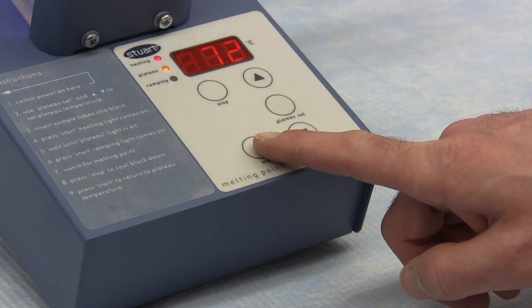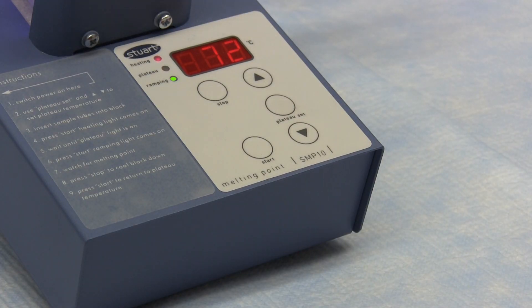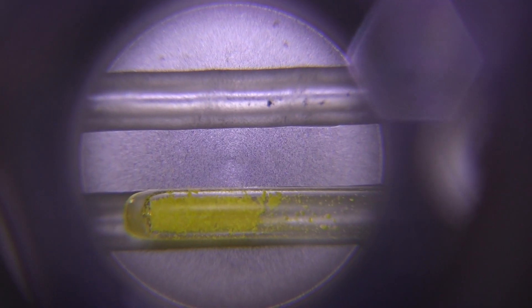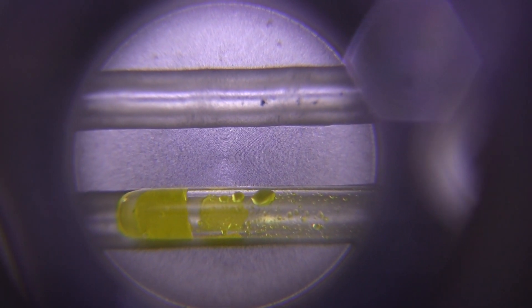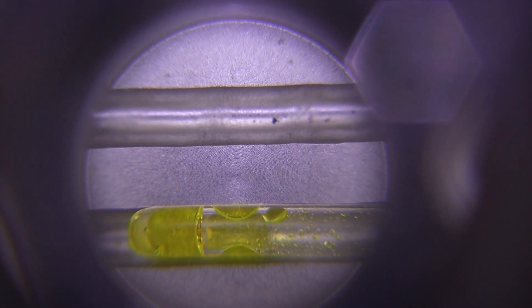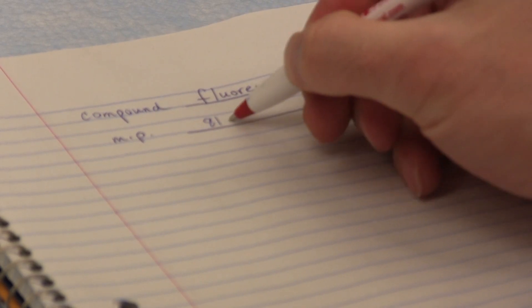Press the start button again and the block will begin to heat at the ramp rate of 2 degrees per minute. At this stage, notice that the plateau light will go out and the ramping and heating lights will both be illuminated. Continue to check on the sample through the magnifier until the solid begins to melt, then note the temperature from the display. Continue to observe the melting sample until melting is completed, and record the melting range.